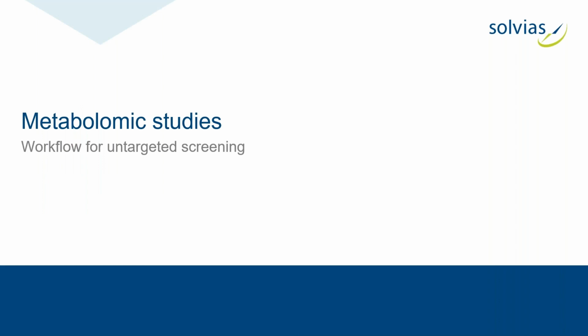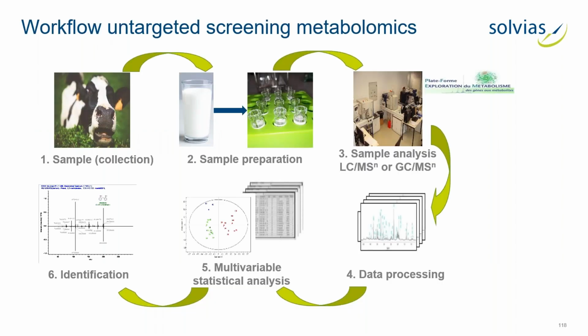Metabolomic studies are quite common. They now have a dedicated workflow for how to do it. Mainly they use untargeted screening in combination with targeted screening. It's very important to use both, which is what we're also doing in E&L.